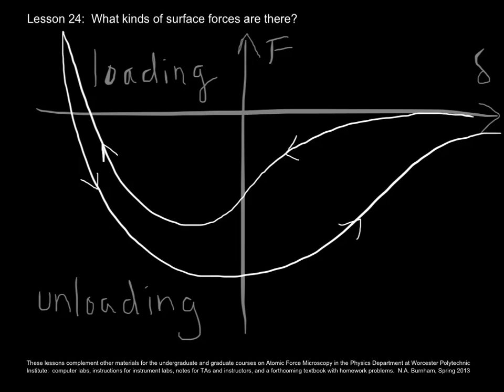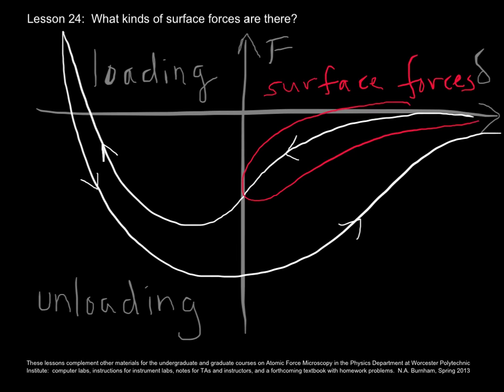So some vocabulary here. When I refer to surface forces, I'm referring to whatever long-ranged forces act between the tip and the sample as you're bringing them together. This part of the curve here.